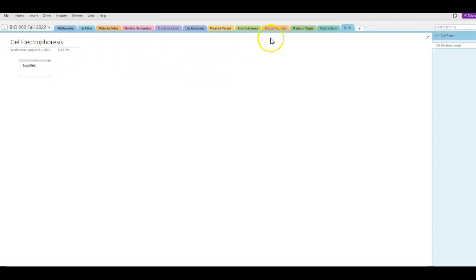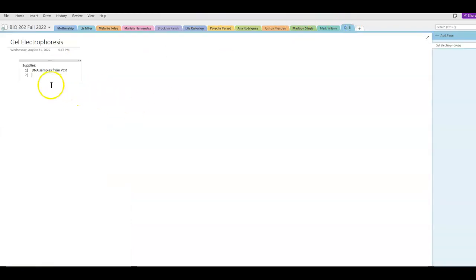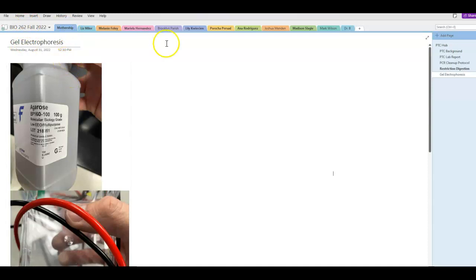So now I'm just being a student. But now if I look back, what are the supplies? Well, we obviously used our DNA samples from PCR. And what else did we use? Oh, look, we used this. Agarose BP160-100. We use that and the lot number because I want to make sure I have the right one. The lot number on that was 218051.